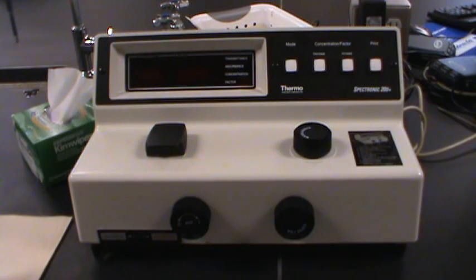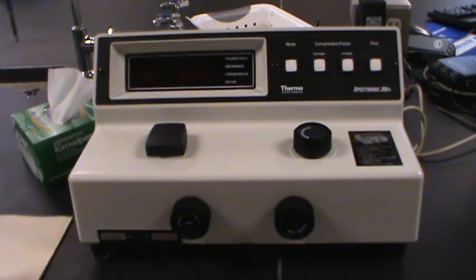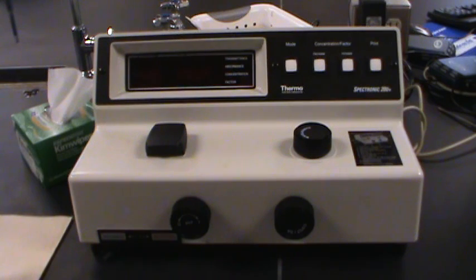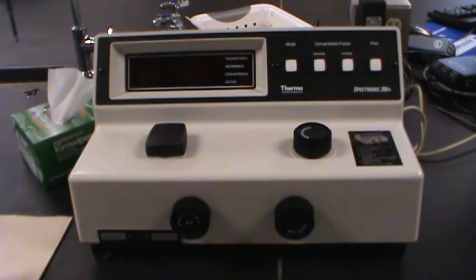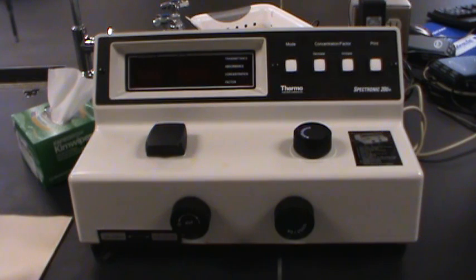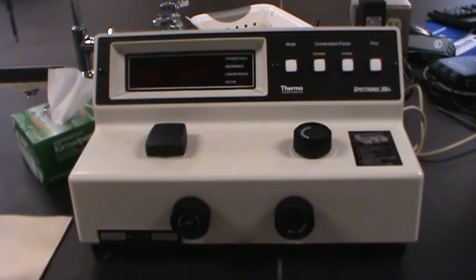In this week's experiment we're going to look at some ways that we can use color to characterize and quantify some of the experiments that we do in Gen Chem 1 and more importantly a lot of the experiments that we're going to be doing in Gen Chem 2.